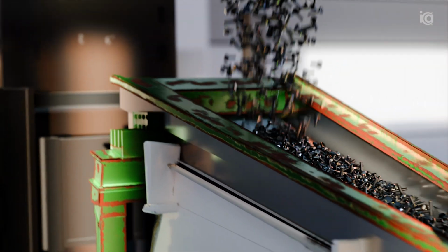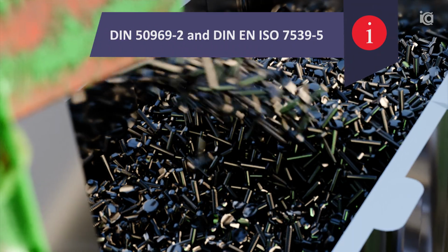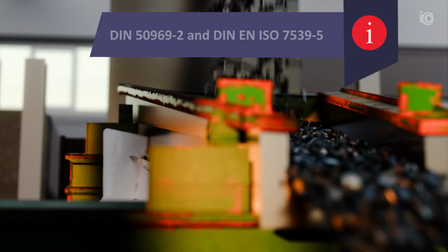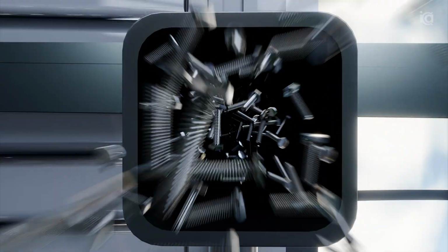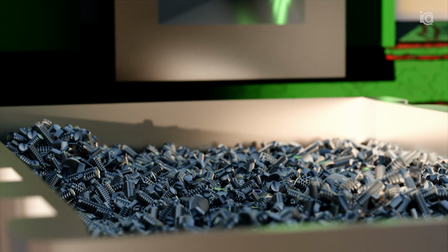To monitor all production steps safely and reproducibly, uniform reference test specimens are required. Standards recommend using C-ring specimens for detection of material embrittlement. These move through all process steps alongside the manufactured components. Successive removal of test specimens after individual production steps ensures in situ detection of material embrittlement.